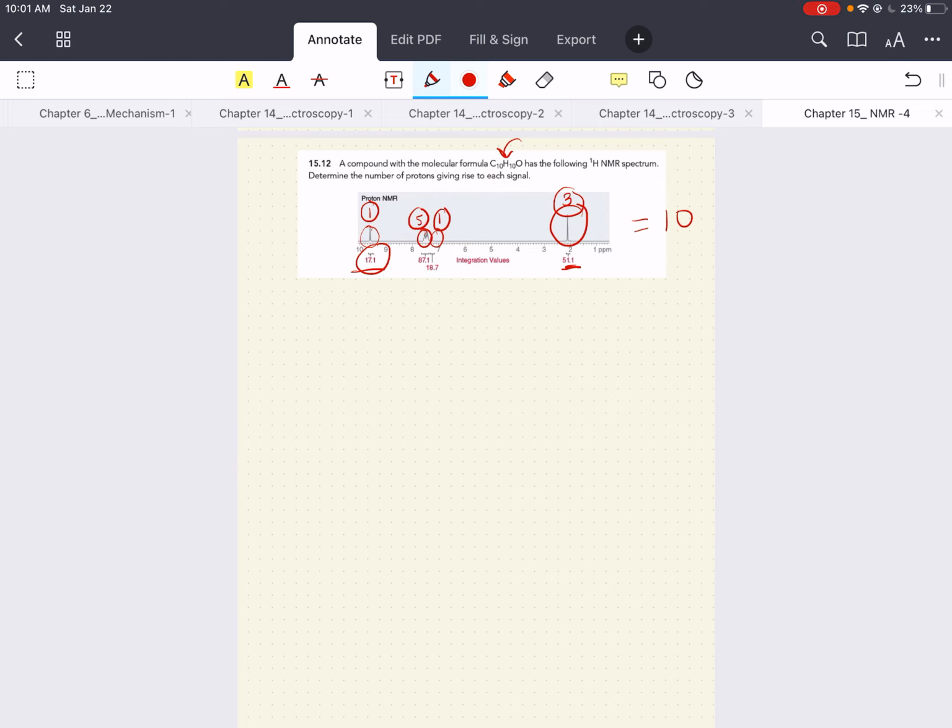In our next session, we'll cover the 4th and last unique piece of information that we can learn from our NMR spectra, and that's multiplicity. And then we'll talk a little bit about carbon NMR.